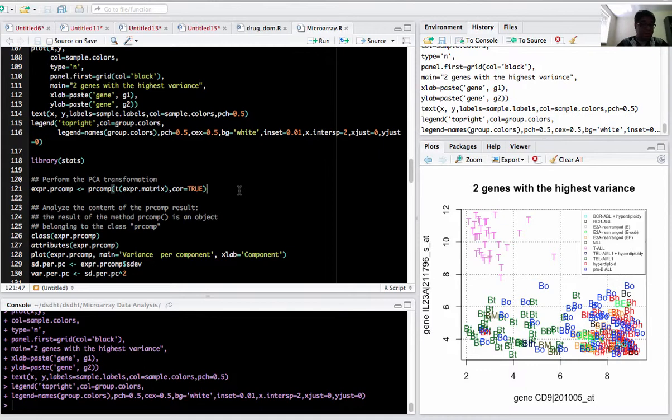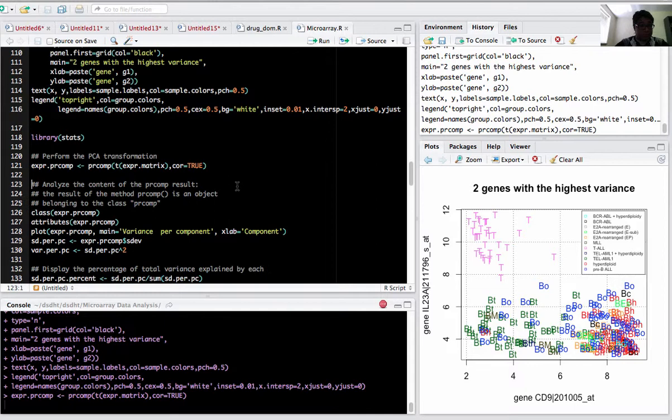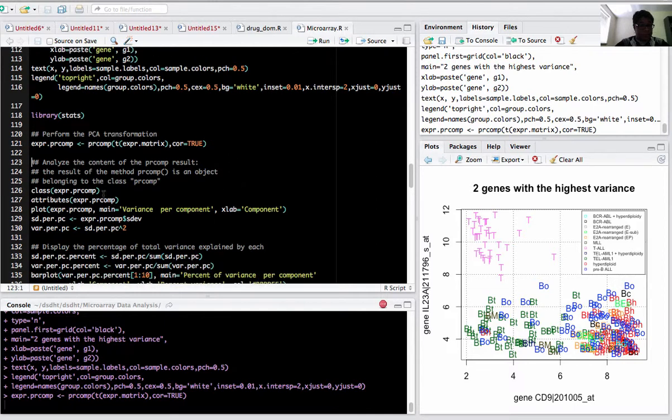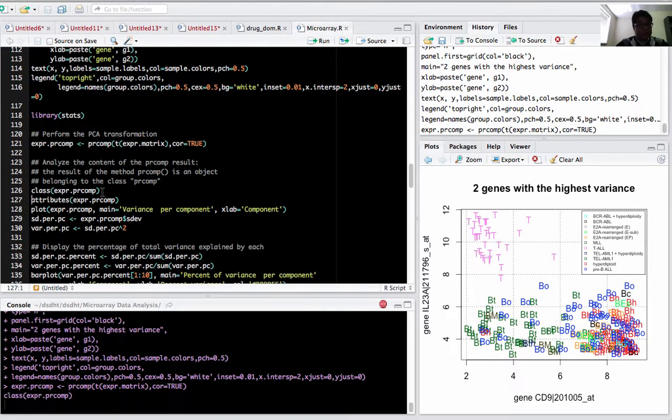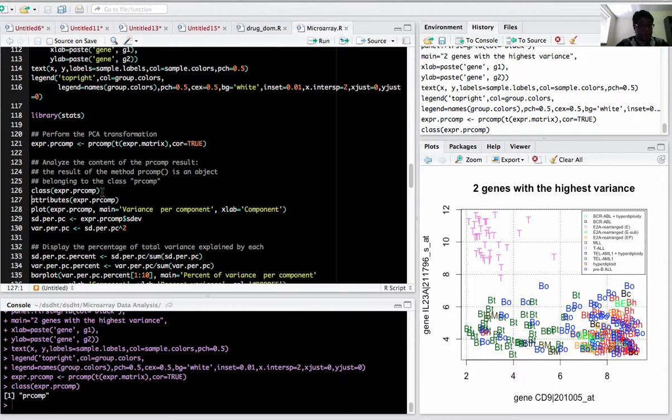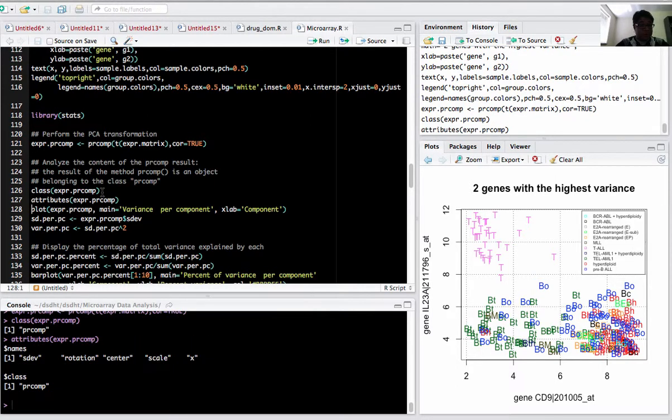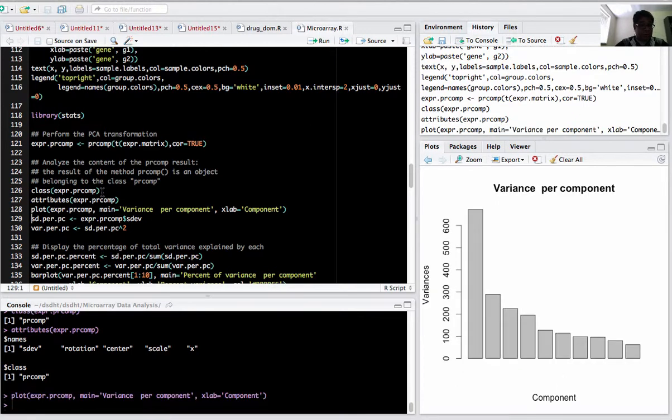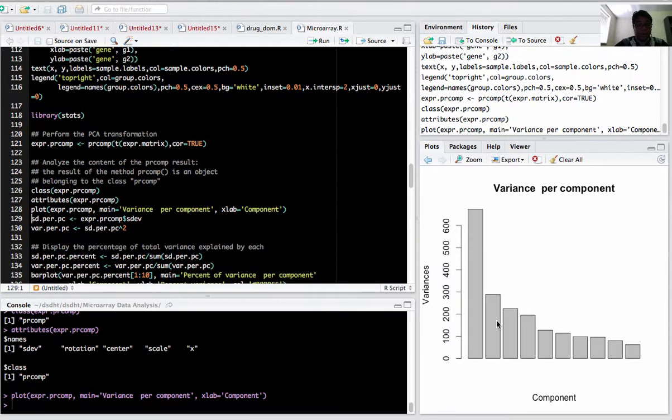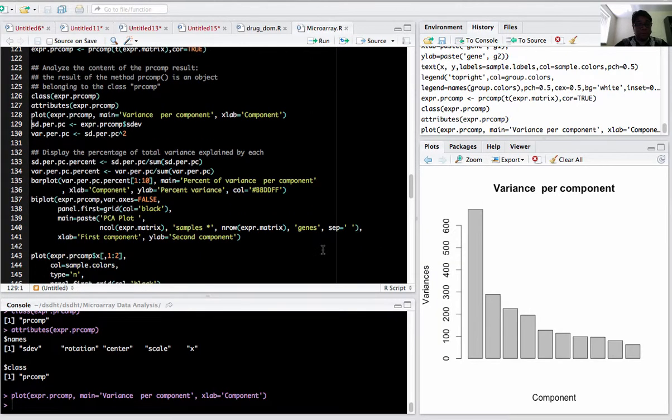Next we'll be using PCA, an unsupervised technique for dimension reduction. I'll use the prcomp function on the transpose matrix. If you want to see what class it is, it's a prcomp class. What attributes are associated with this? It has sdev, rotation, center, and all those. If you want to plot the components - component 1, 2, and 3 - component 1 has the highest variance. You can plot these variances in three dimensions where you can easily classify the groups.